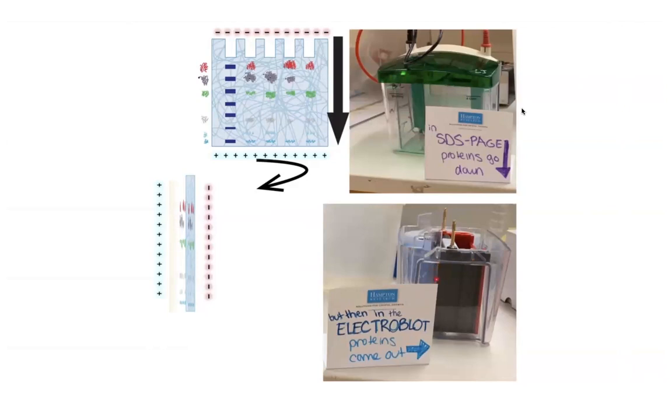Sometimes there are different formats of electroblot. This is a wet transfer. There's also a dry transfer, semi-dry transfer. There are basically a lot quicker ways. Like in my postdoc lab, we had this really cool device that did the Western blot in like 10 minutes, and it was awesome. But this is the more classical way, and it's long and tedious and uses methanol or ethanol and stuff. So there's a lot of waste you have to deal with, and it's not very fun.